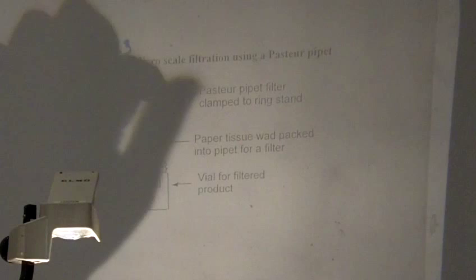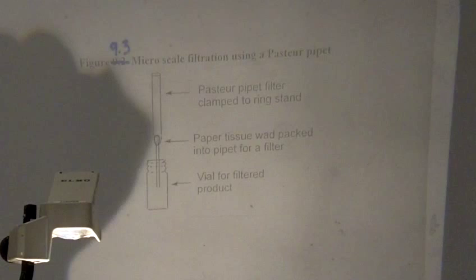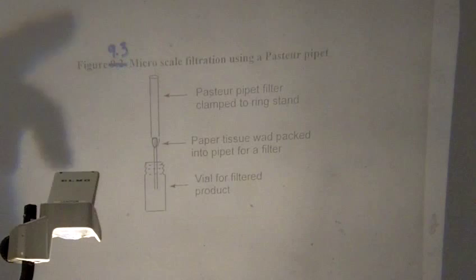These pipettes then need to be, once you're done getting your alkene out, rinsed with acetone into the organic waste, and then there's a beaker in the reagent hoods to collect these pipettes. So once you've turned your pipette into a filtering pipette, you're not getting your pipette back again, so don't try and salvage it, okay? We're just going to dispose of them. Rinse them out with acetone into the organic waste, and then put them in the container in the reagent hood. If you don't rinse them out, the alkenes have quite a stench. The whole lab's going to start smelling like all sorts of different alkenes, okay? So rinse it out before you take it out of your hood. Then you have your alkene, okay? You get the yield.